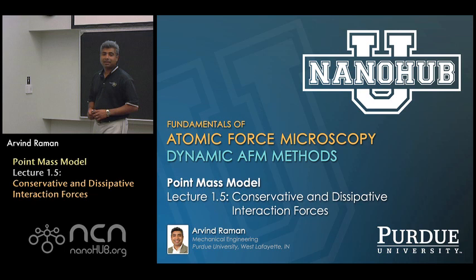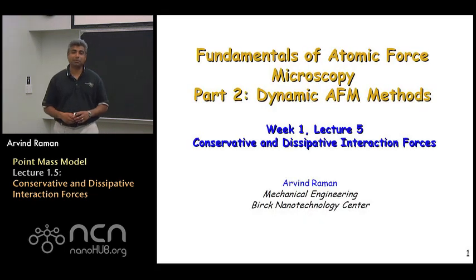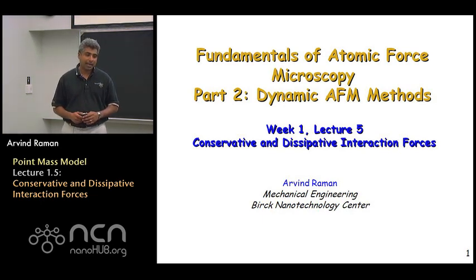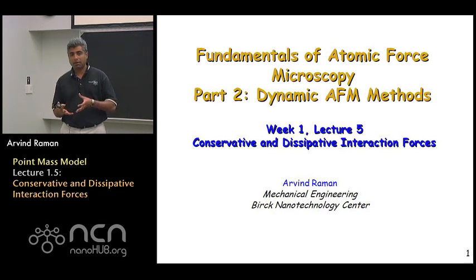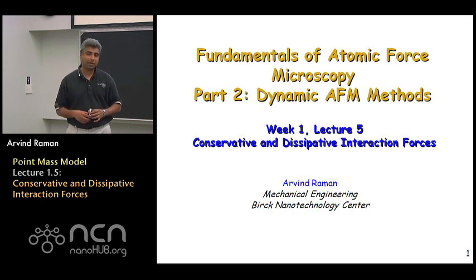nanoHUB-U, online instruction. Hi, and welcome to Lecture 5 of Dynamic Atomic Force Microscopy Methods. In the last few lectures, we've been focusing a lot on the exact and accurate point mass models of the AFM probes, the idea being that we really measure forces in AFM through the measured probe dynamics, so we really need to have a good model of the AFM probe in order to be able to convert what we observe, which is the motion of the cantilever, into the forces, which is where the real physics of atomic force microscopy lies.